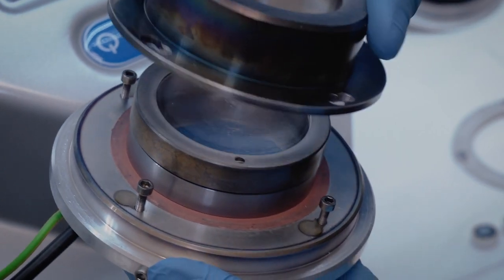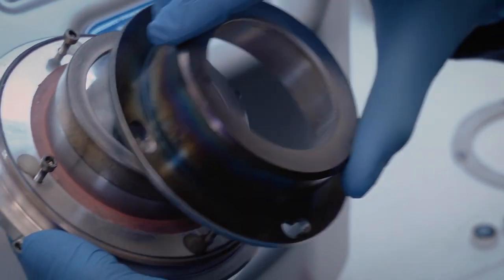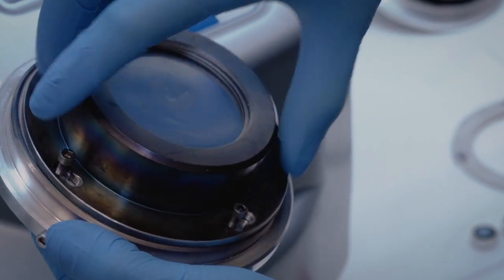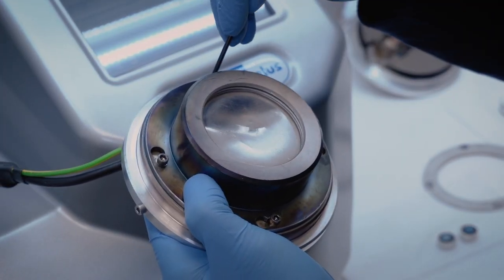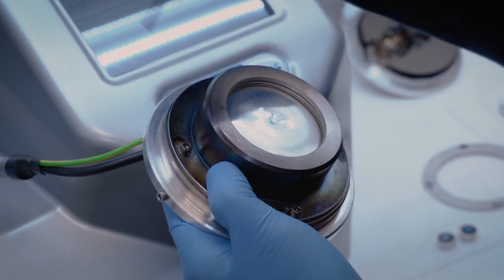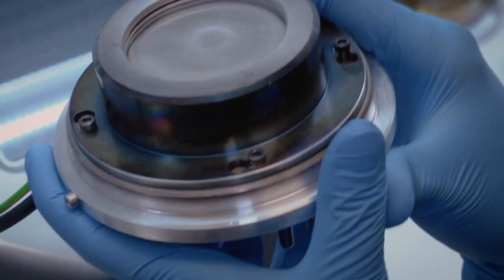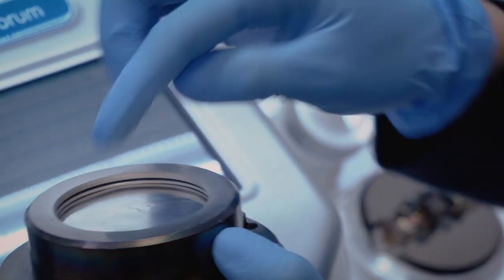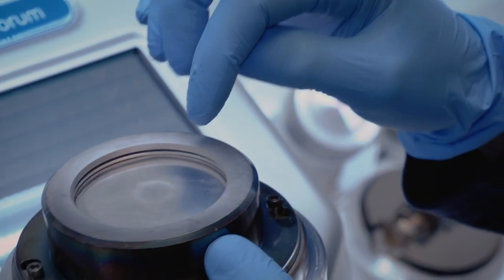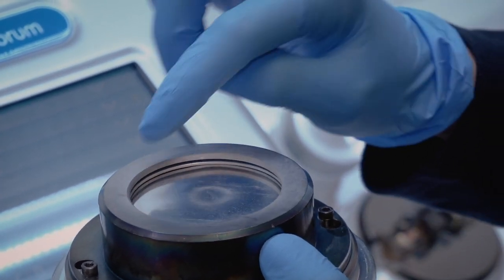After removing the holder, you can change your target. Secure it by screwing the holder back in and placing the top shield back. Please note that for thicker targets, a special spacer is used to create a gap between the top shield and the target, which is used for plasma formation.